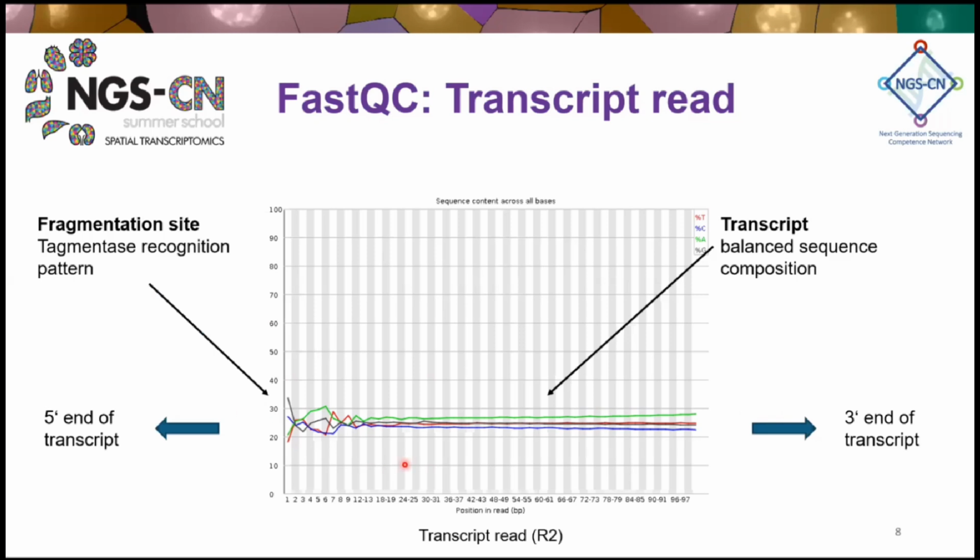And this is an unusual pattern. But remember, when we do the sequencing, our transcripts are 1 KB, 2 KB, even 10 KB long, and the constructs will be the same. But the sequencer cannot sequence 10 KB. You have to cut down the reads or the fragments to a certain length of 600 bases.